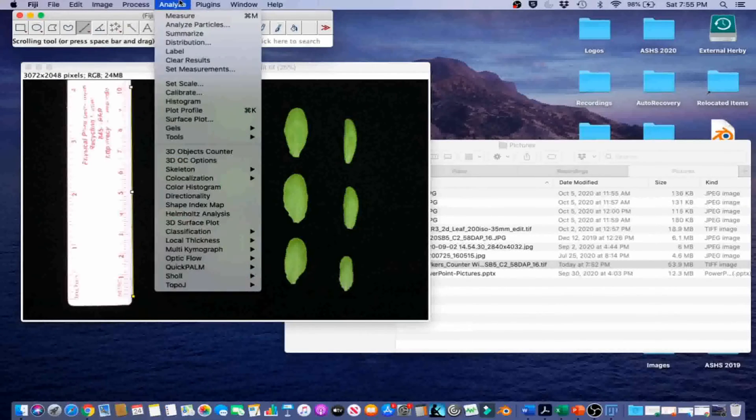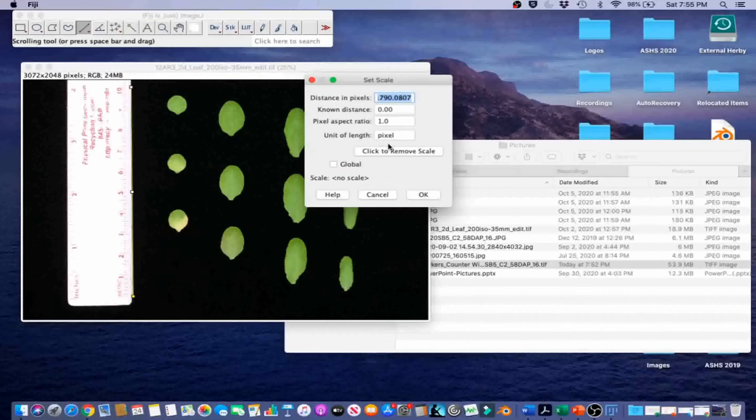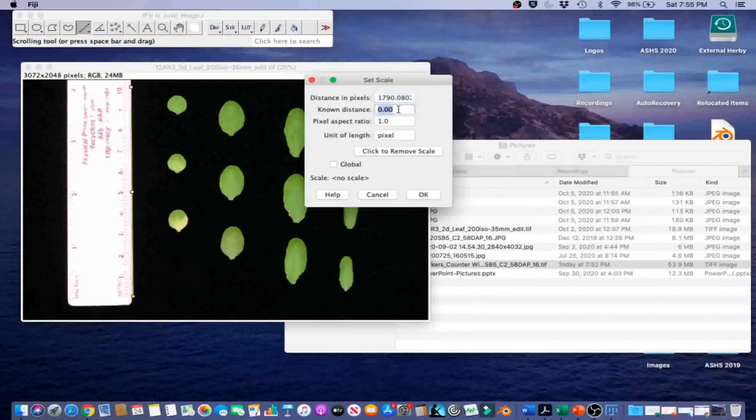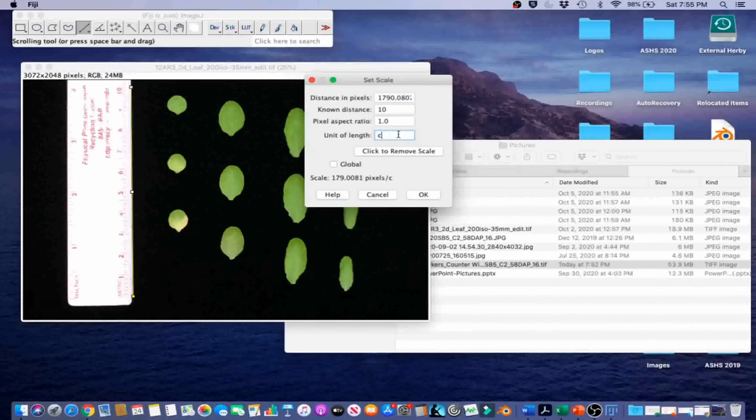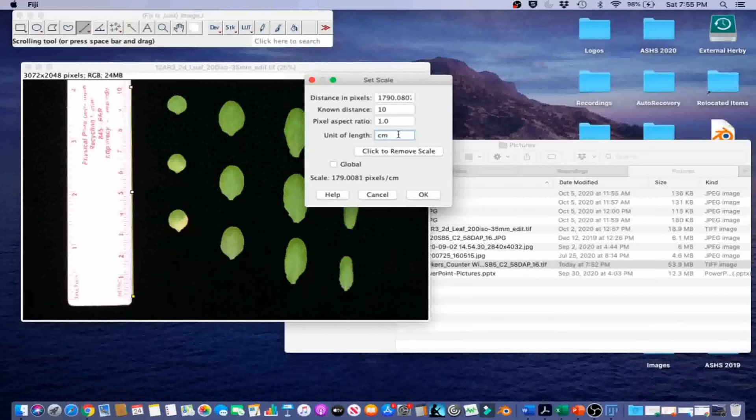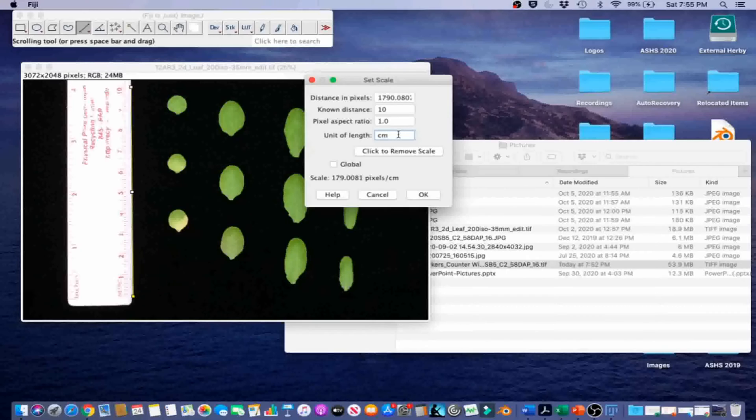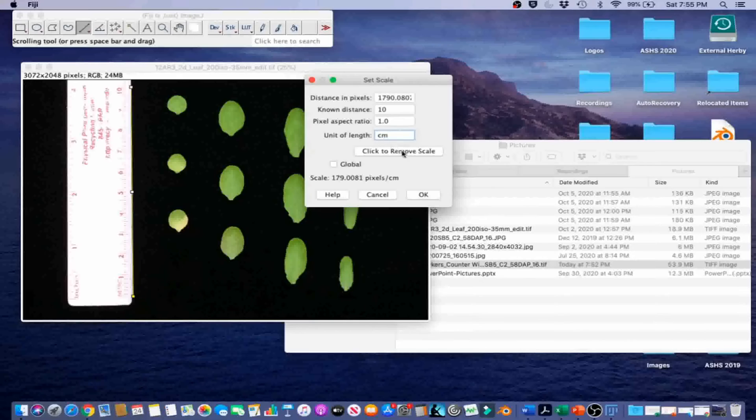Next, we're going to go to Analyze, Set Scale. We're going to set the distance to the line. We're going to fill in 10 for known distance and centimeter for unit of length. We're going to keep global unchecked. When the global option is checked, the same image calibration will be applied to images that will be imported subsequently. We use this option when the same image needs to be imported multiple times to perform different sets of image analysis, or when all images in a set have the same scale. In this case, this is the only image with this scale. And Set Scale must be done again for subsequent images. So we're just going to go ahead and click OK with the global unchecked.